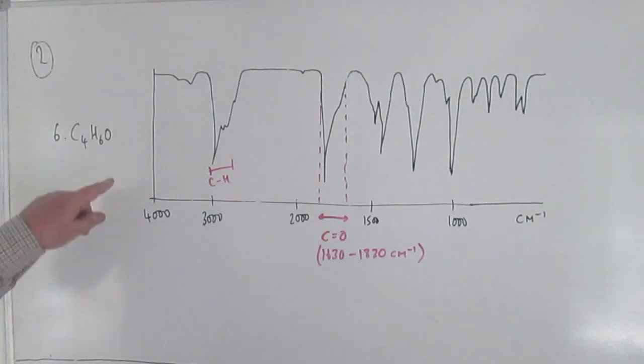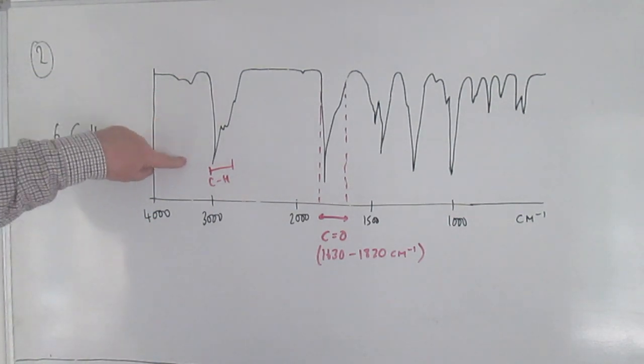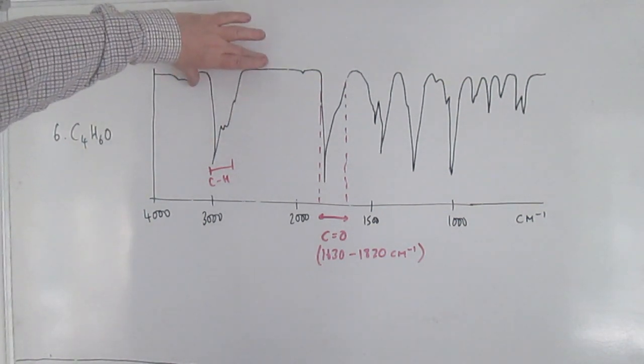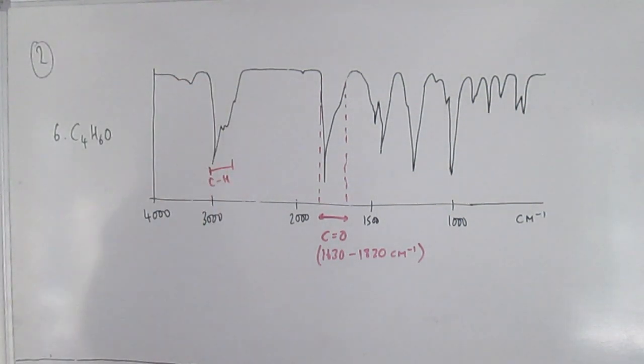No OHs, again there's only one oxygen, so there couldn't be an OH as well, but clearly not, because there would be a nice broad alcohol OH peak there if there were an alcohol group, and you'd have this big broad carboxylic acid peak spanning where the CHs are, but it's not, it's nice and sharp there, so that tells you that's not a carboxylic acid either. So again, that's all the infrared can really tell us, is that it's got a carbonyl group.